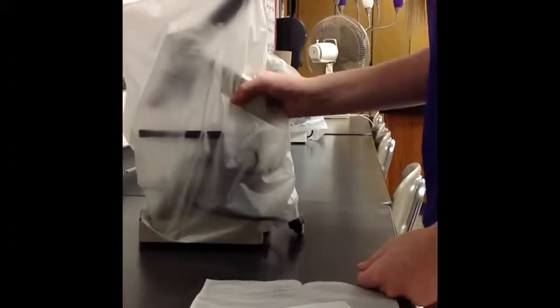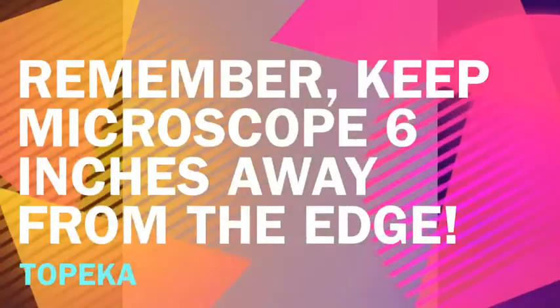When you carry it, use two hands to support it — one on the arm and one under the base. Remember, keep the microscope six inches away from the edge.